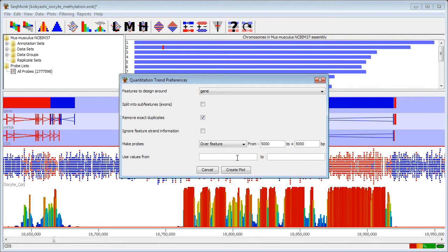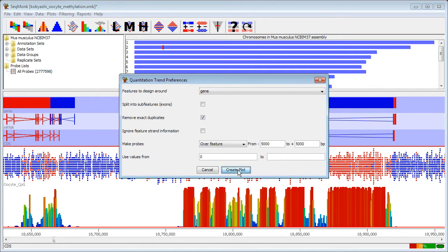The methylation quantitation pipeline assigns a value of minus 1 to any region that it couldn't quantitate with a real methylation percentage. So if I just filter from values starting at 0 up to 100% in this case then those unmeasured regions will be excluded from the Quantitation Trend Plot and then I'll create the plot.